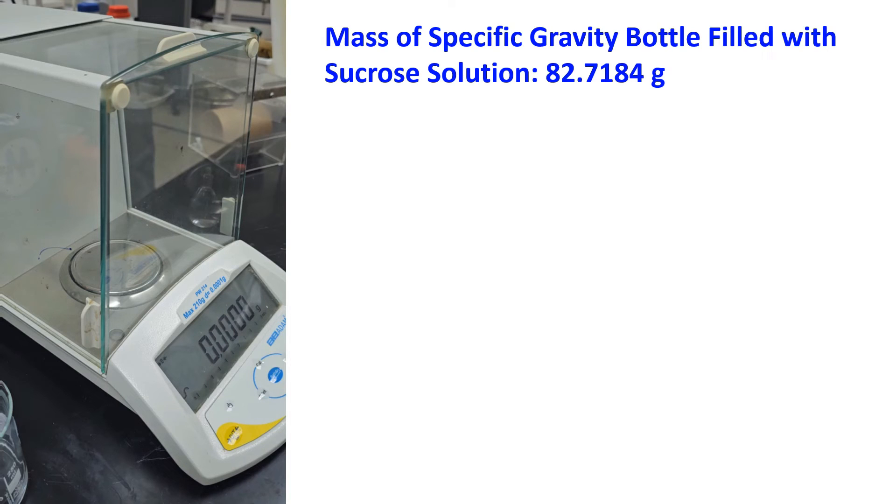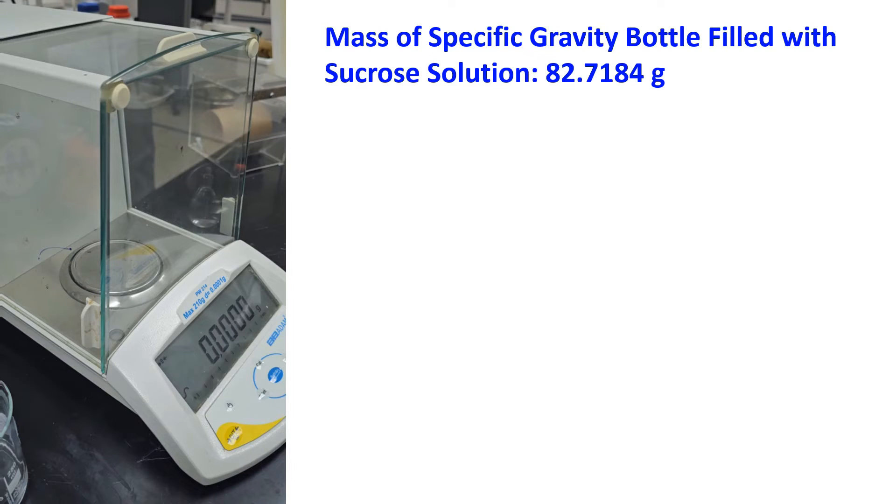We are now weighing the mass of the specific gravity bottle filled with sucrose solution. The mass of the specific gravity bottle filled with sucrose solution is 82.7184 grams.